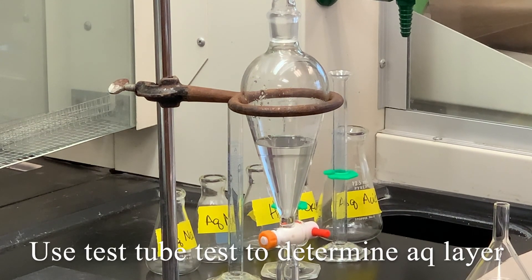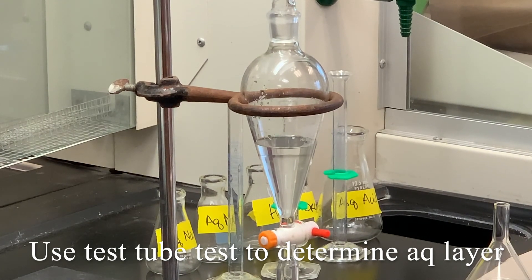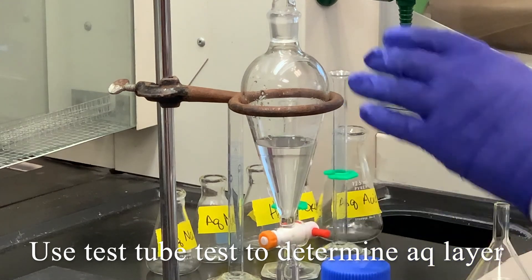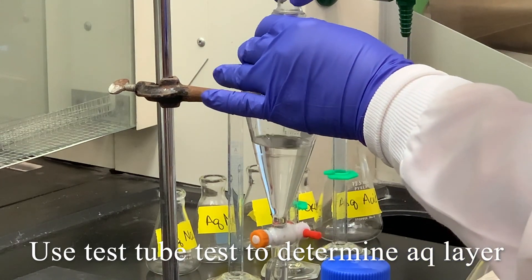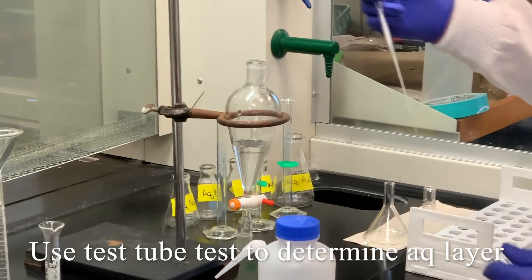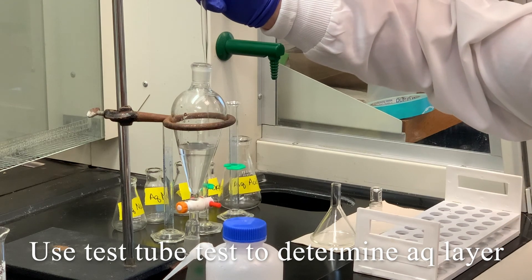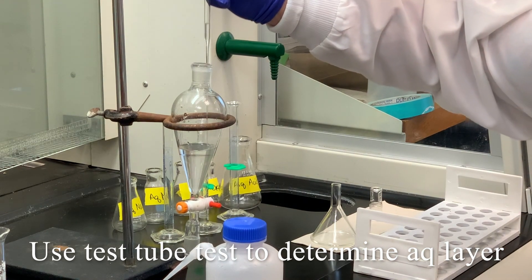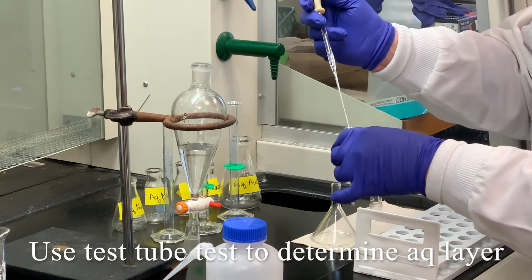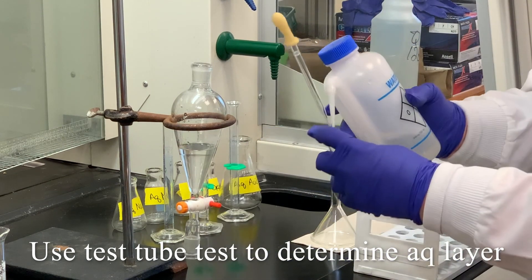But just to kind of go through that test tube test again, I think that is very useful. So what I'm going to do is I'm going to remove the stopper, and I'm going to take some of the top layer, add it to the test tube, and then I'm going to add water to that.